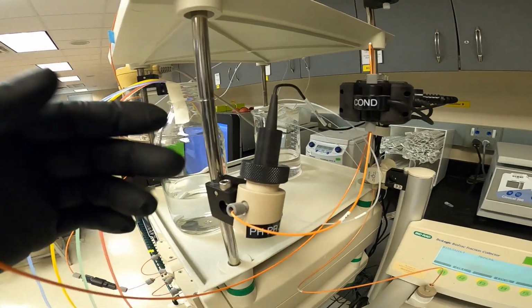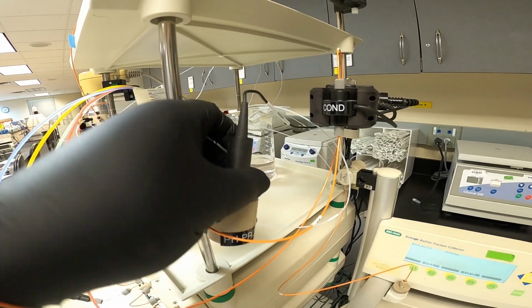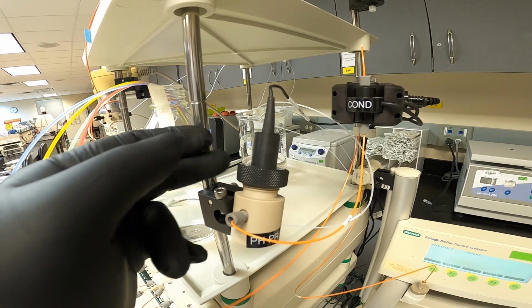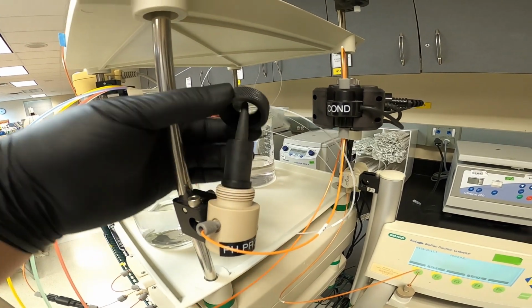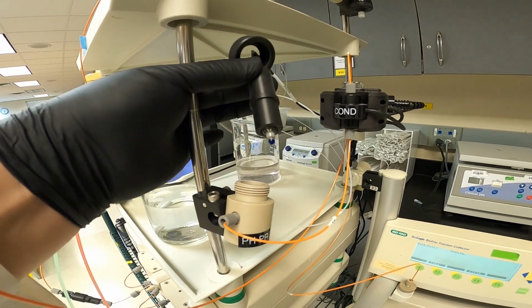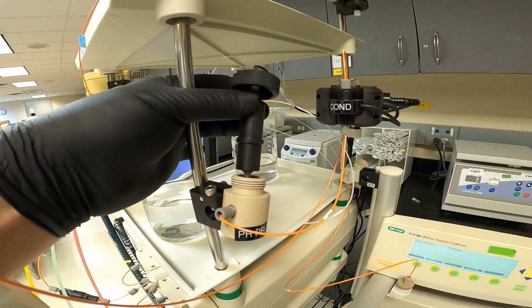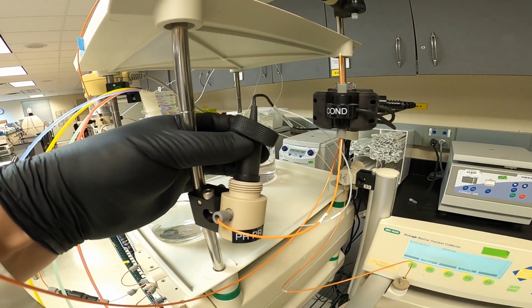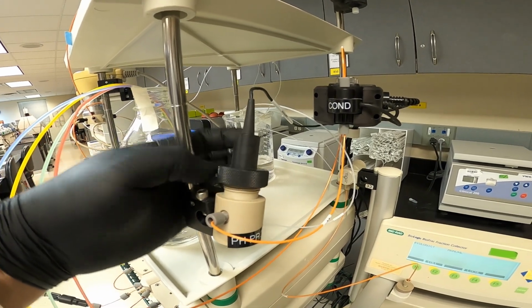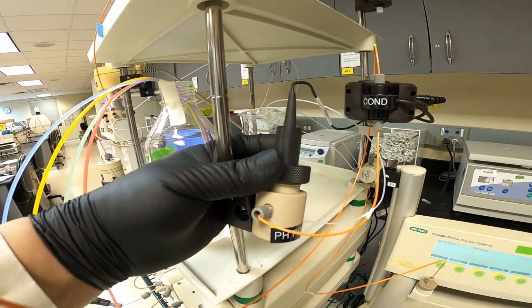So we'll make sure that the flow is stopped, and then in order to access it, we're going to remove or unscrew the ring here. So that should unscrew by itself. All right, I'm going to pull that up, and then we can remove the pH probe. And that's what we'll rinse and then drop in our pH standards. In order to replace it, we'll just put the probe back in, make sure it's seated properly, and then screw back down the probe.